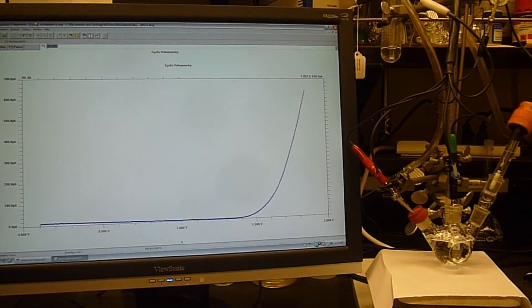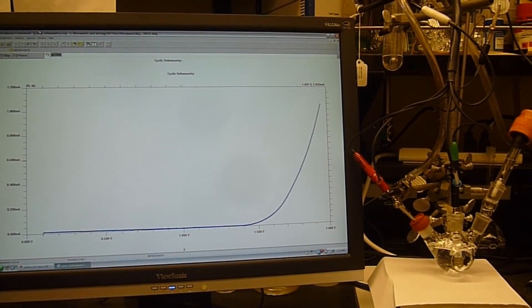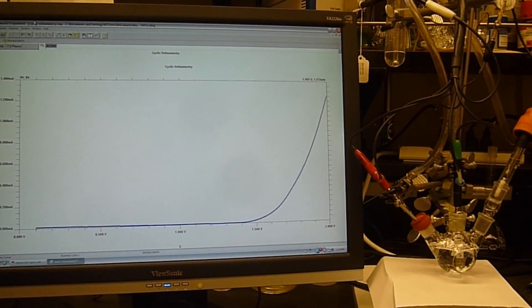Here we're measuring a dark cyclic voltammogram of our tungsten oxide film, and what you're seeing is an increase in anodic current related to the oxidation of water.